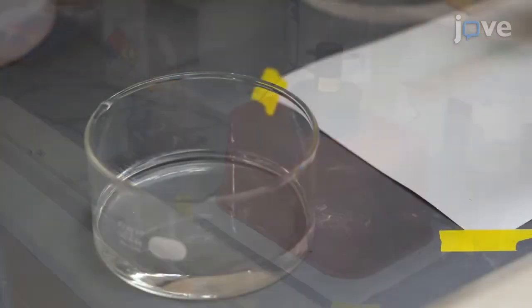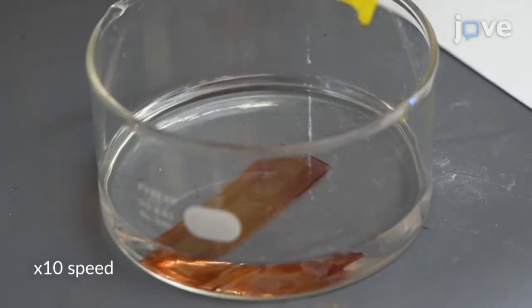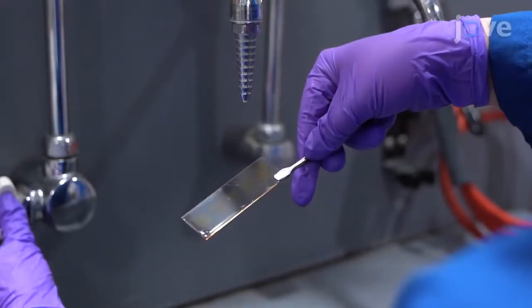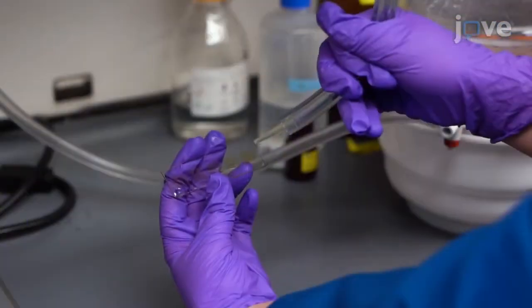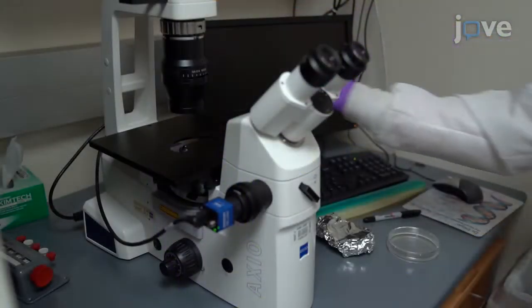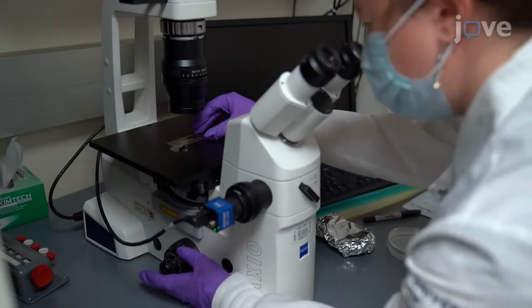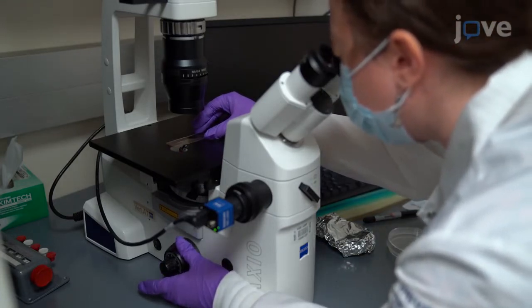Develop the slide by immersing it in the developer solution for 3 to 5 minutes. Then rinse away excess developer solution with water. Dry it under a stream of air or nitrogen. Observe the slide under a microscope to confirm the success of photolithography and store it in the dark.